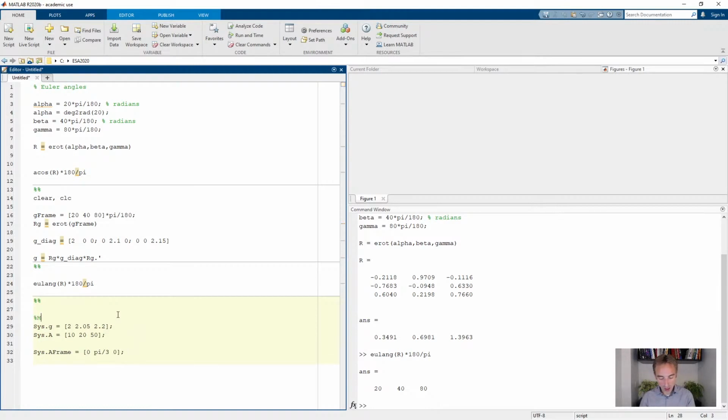An important concept in EasySpin is the molecular reference frame. Everything in the spin system is relating to that XYZ system, which you can just picture yourself however you want within the molecule, but it's fixed. And we have specified an A frame, which means the A tensor is tilted relative to that molecular frame.